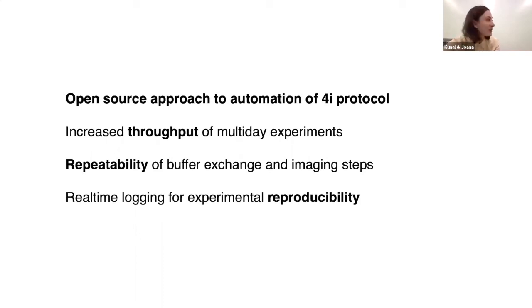And I was very lucky that I worked closely, physically, at the New York Genome Center, very close to Kunal and Will and everybody else in the tech innovation group, who thought that we could adapt a HiSeq to do these experiments. And so the really cool tool that they have developed enables us to basically conduct automated, unattended 4i on multiple samples in parallel, thereby increasing our throughput.